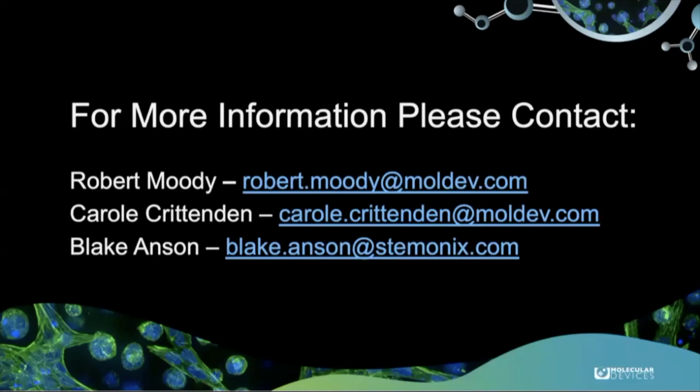One other question here, just coming in late. The spheroids, while shipping, are there effects of hypoxia, stress, or phenotypic changes from the environmental stress during shipping? Have you durability tested your shipping regime? Yeah, definitely. And we do not see any negative effects.